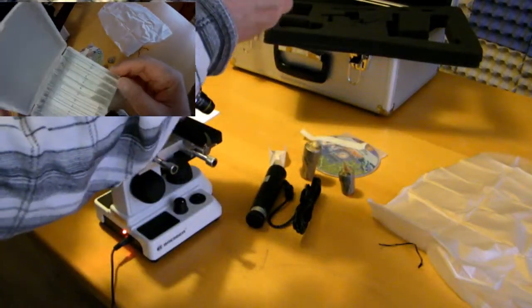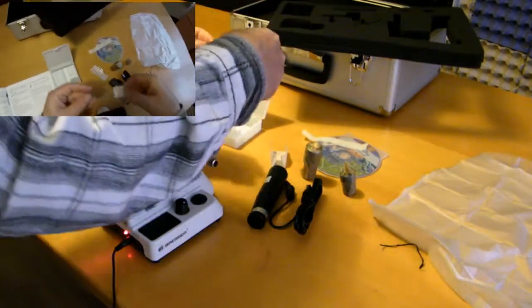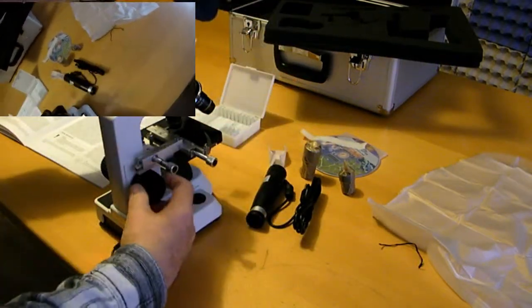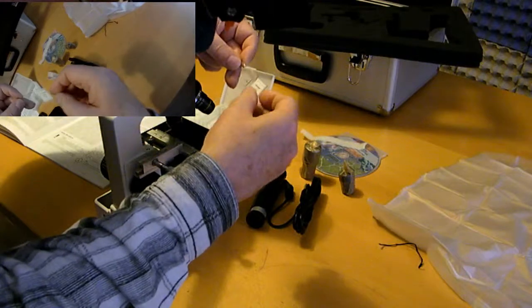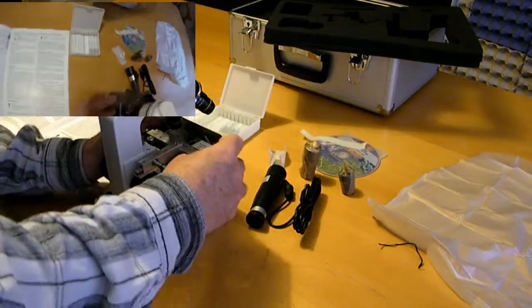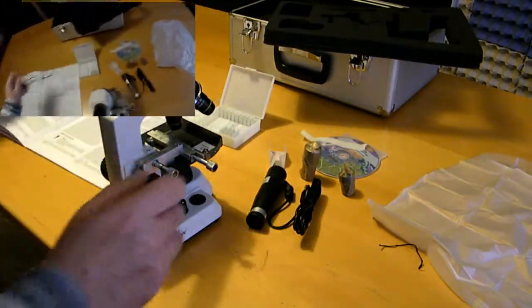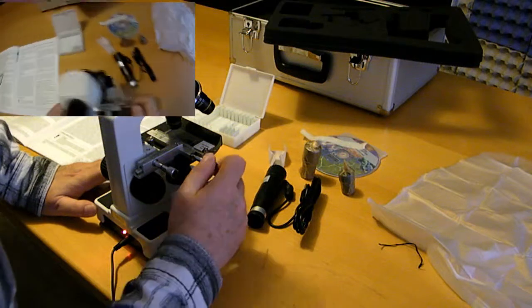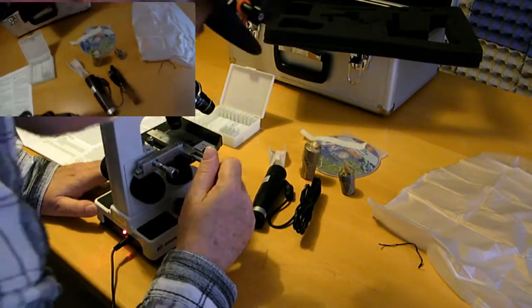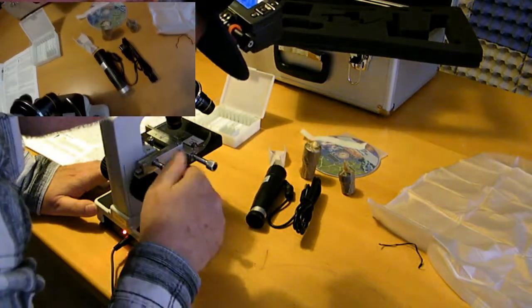I'll just use classical house fly legs. This way, okay. Put it down. I see. Yeah. So, I have to get rid of my glasses. Do I see something? Do I see anything? No, I don't. Oh yes, but I should, of course, adjust the slide stage.